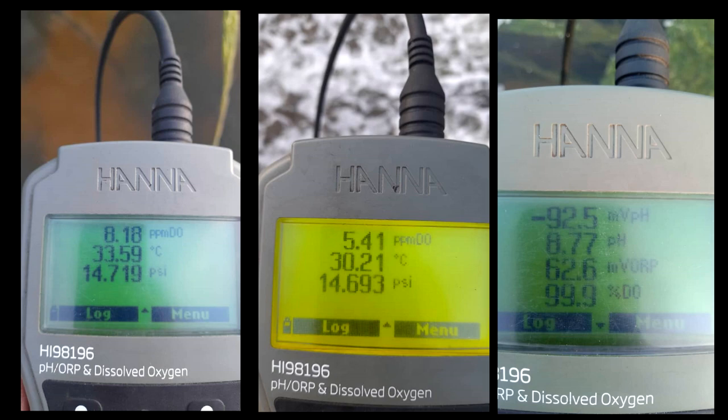So the first model I bought was this model. It's actually a very cool model — it allows you to log in real time the dissolved oxygen at every 1 minute or 5 minute interval. We typically use this in our shrimp farm. You can see it also has an external light, so great for conditions where it's not well lit, especially if you are taking the dissolved oxygen reading early in the morning.